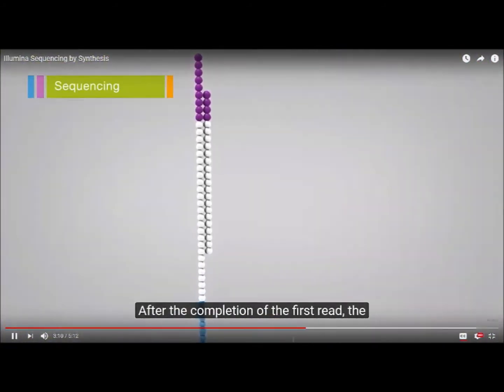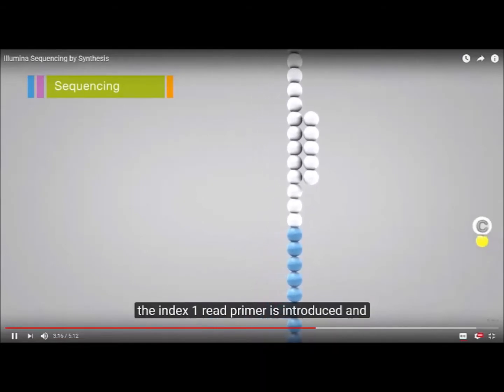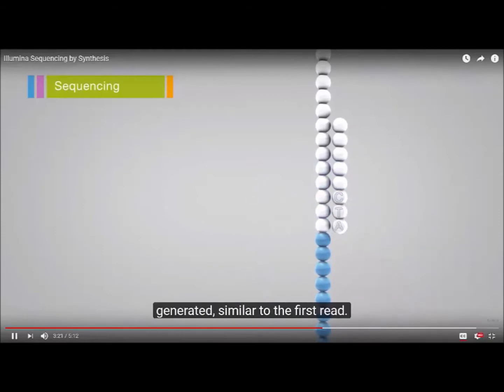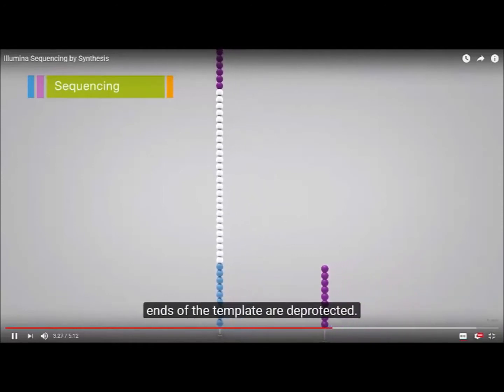After the completion of the first read, the read product is washed away. In this step, the Index 1 read primer is introduced and hybridized to the template. The read is generated, similar to the first read. After completion of the index read, the read product is washed off and the 3' ends of the template are deprotected.